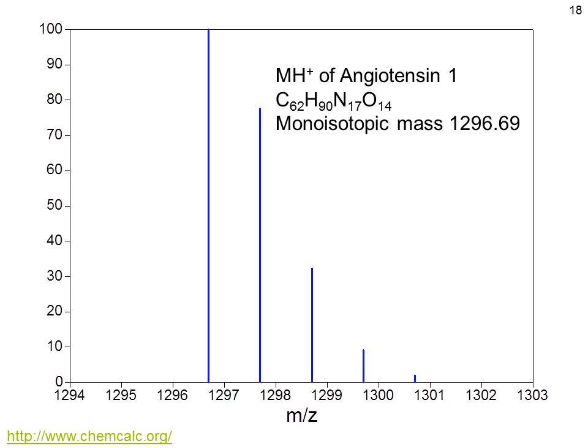Why is that so interesting for mass spectrometry? Now we can define different mass values. The leftmost, biggest peak is the so-called monoisotopic mass, 1296.69. We can define this mass with very, very high accuracy, because we're only looking at the C12 isotopes. You might ask, what about the hydrogen, nitrogen and oxygen isotopes?